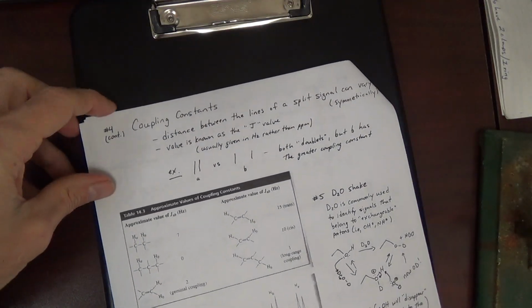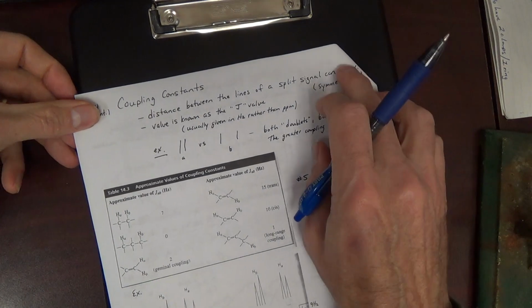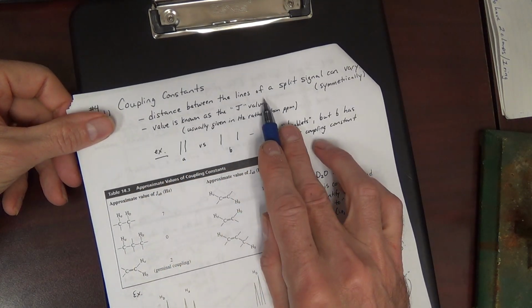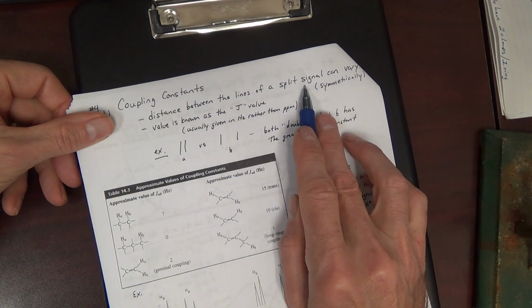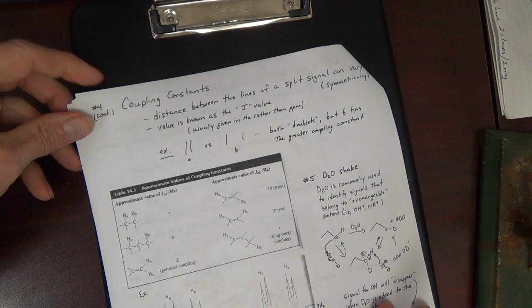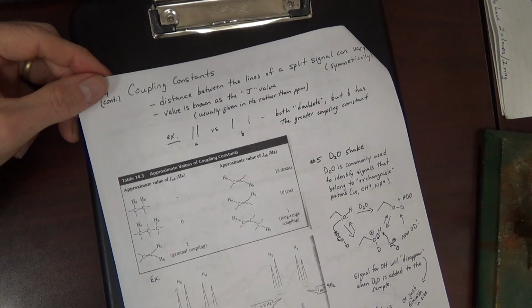Okay. Along with the splitting, we want to look at something called coupling constants. The coupling constant is the distance between the lines of a split signal. Okay? And this distance can vary. The distance is known as the J value.